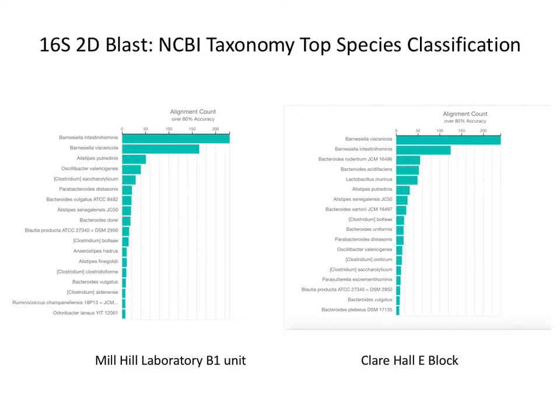So what about the error rate? It's a problem, but one of the things is that you will lose a lot of data. If the error rate is high and it cannot line them up, it will throw it away and you become probably unclassified. So maybe what you need to do is go back and look at those unclassified reads and ask: is it because the Q scores were really poor, so you can't put them in a bin, or is it because it's an organism you can't find? But you do get a bit more out of this than you do.